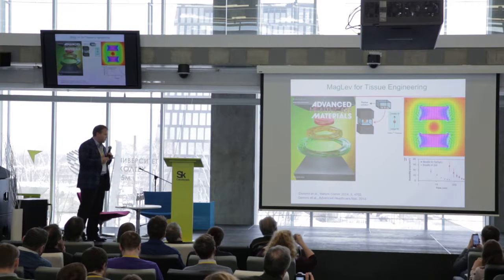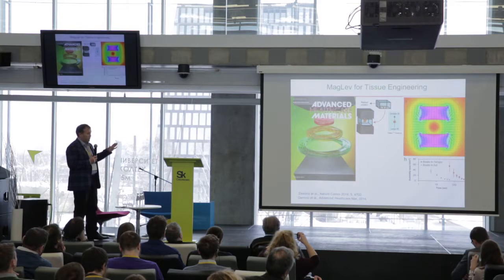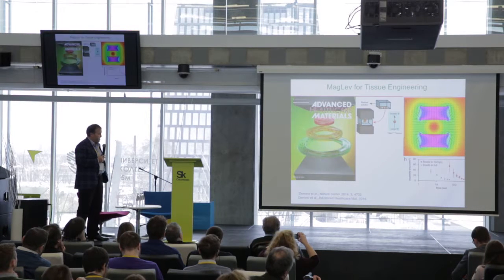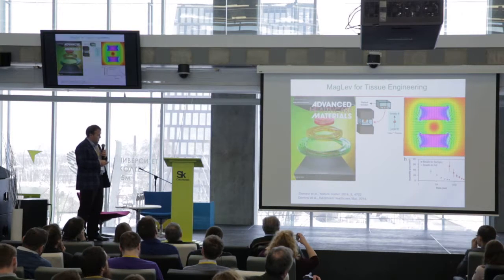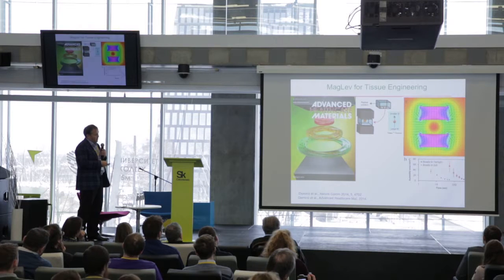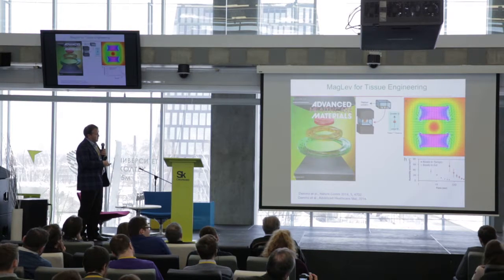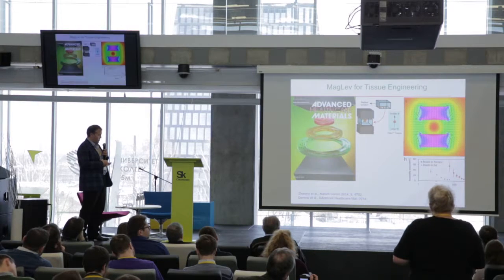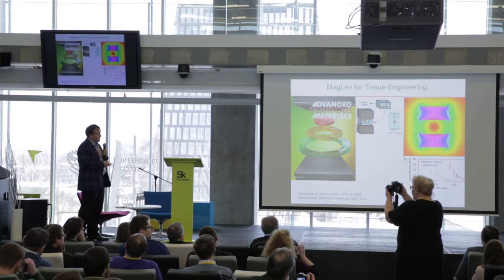They can be taken for further genomic and proteomic testing. So how do we take this magnetic levitation system and apply it to biomanufacturing, biofabrication, and bioprinting? We got there by controlling the magnets and scaling this up. When you put two magnets opposing each other, you have a hot point that everything is pushed to, which is less magnetic than the environment. We take different gels that we designed by playing with their material properties to have different densities.